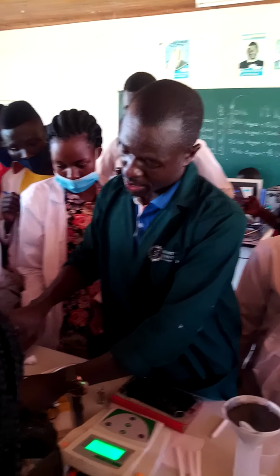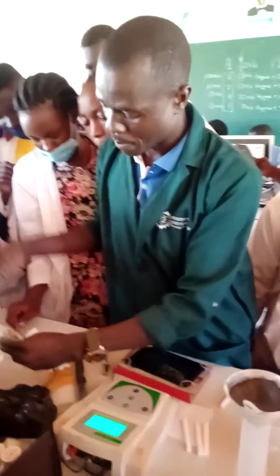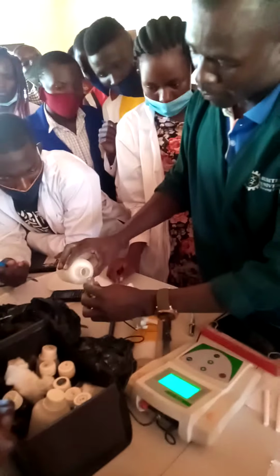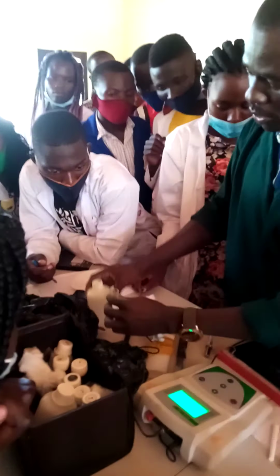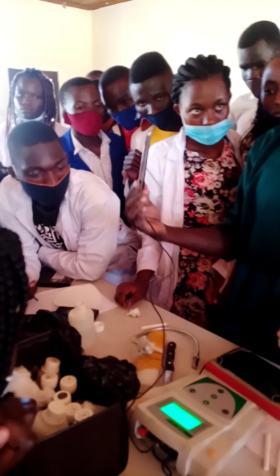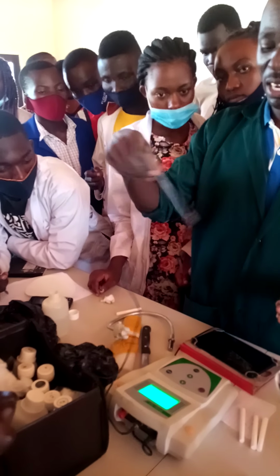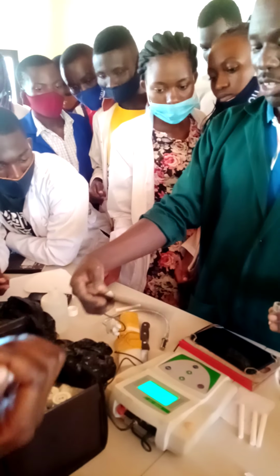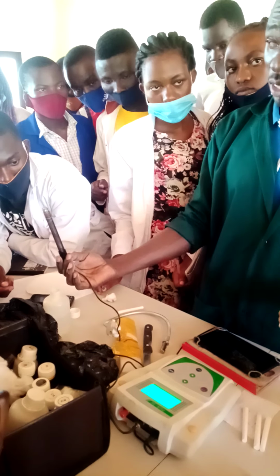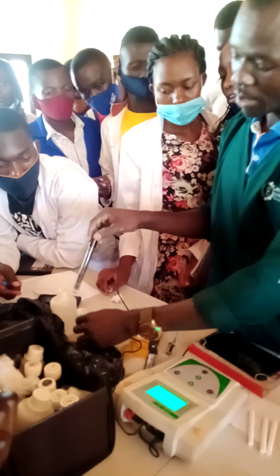So the sensor has to be in deionized water so that you read off from 7. But of course, the moment you take it out like this, even the air here has a different pH. You can see how much carbon dioxide, because remember carbon dioxide will take us to acidity, isn't it? You can look at how we can affect the pH.